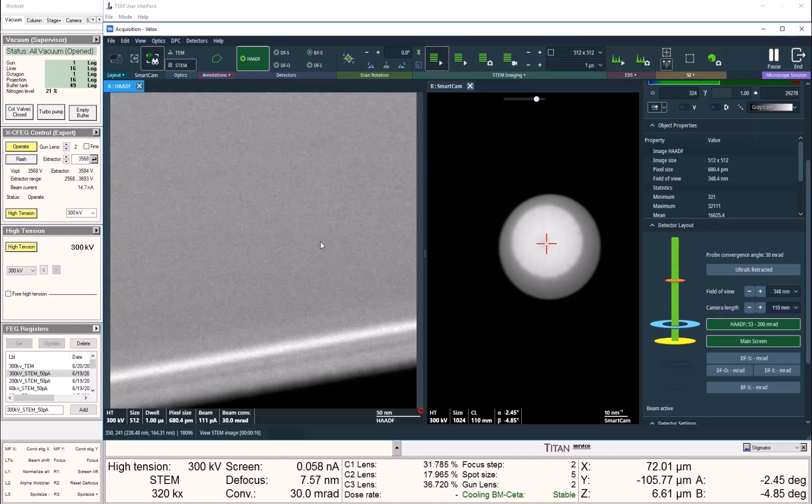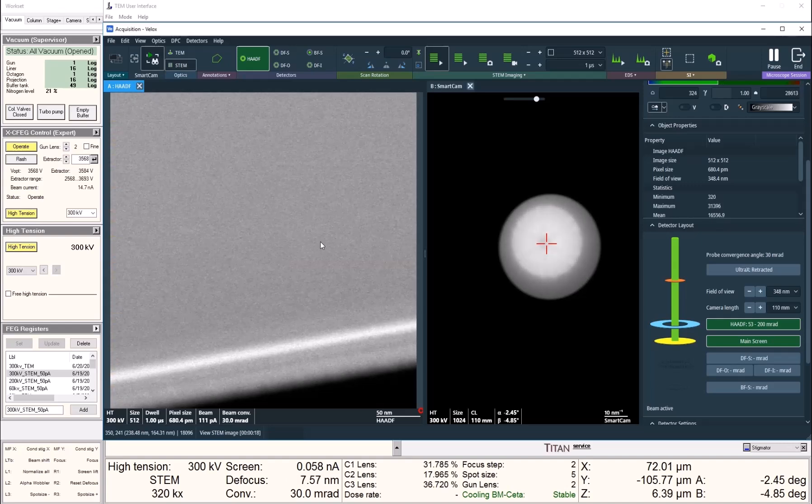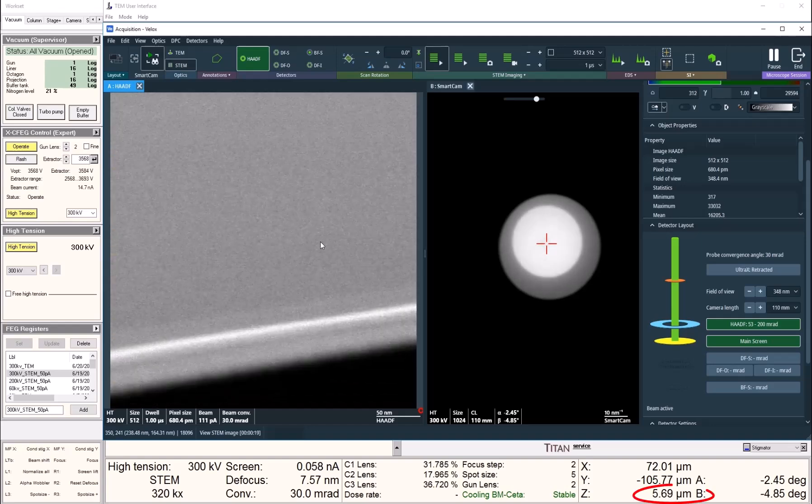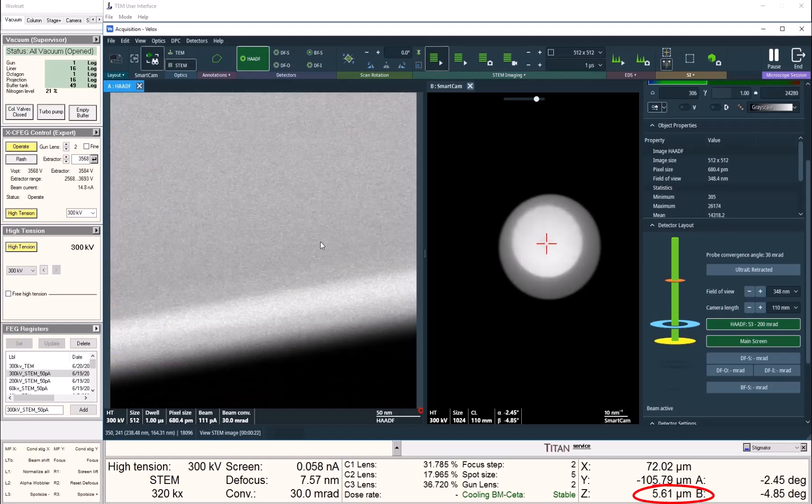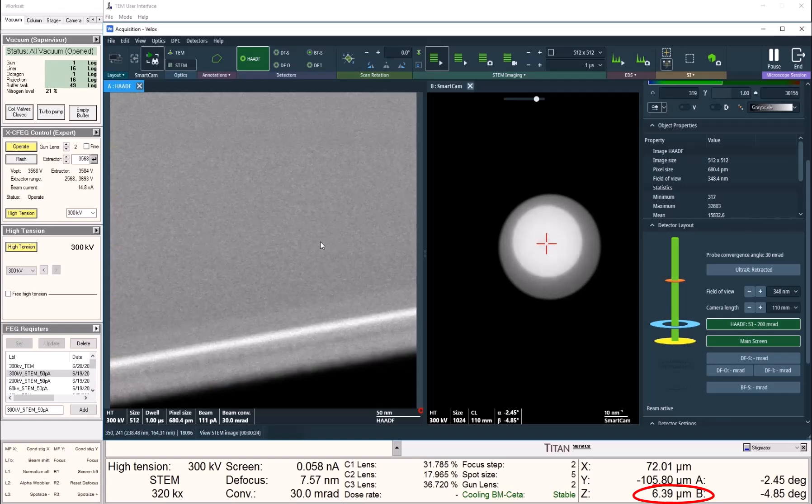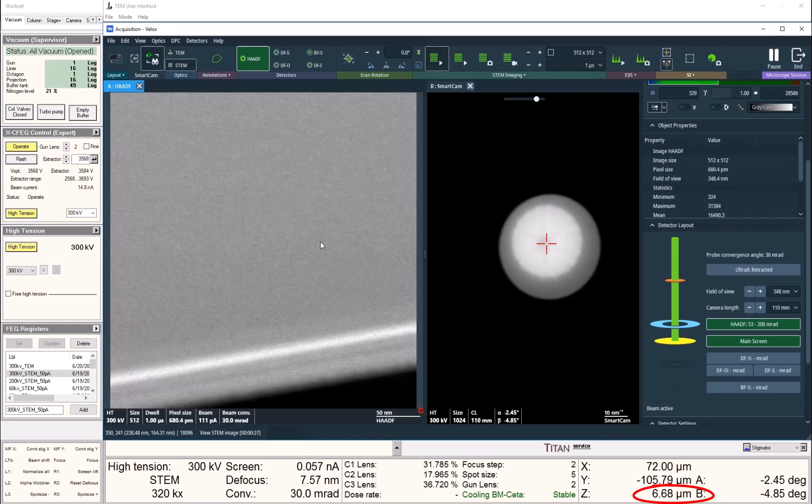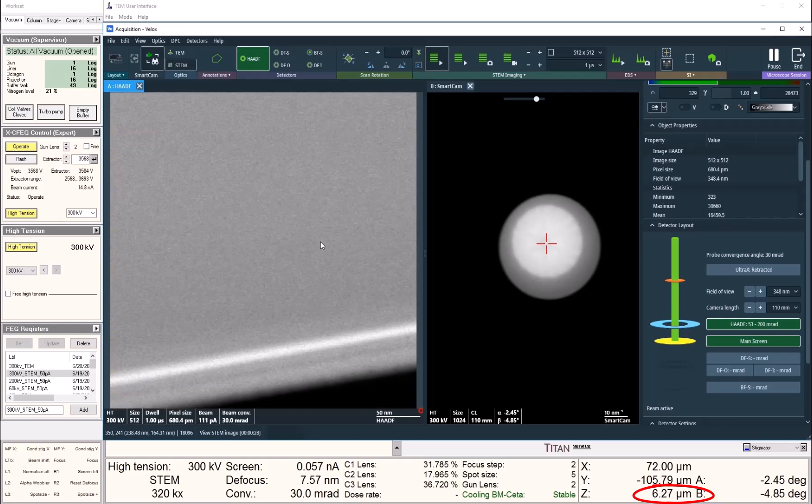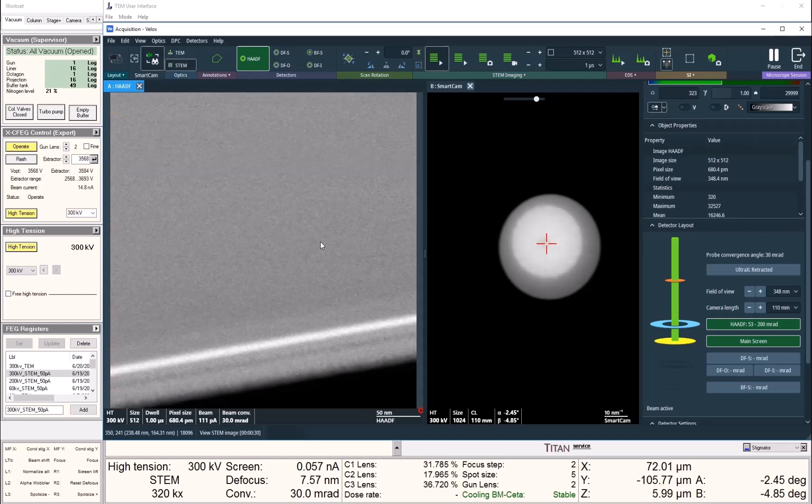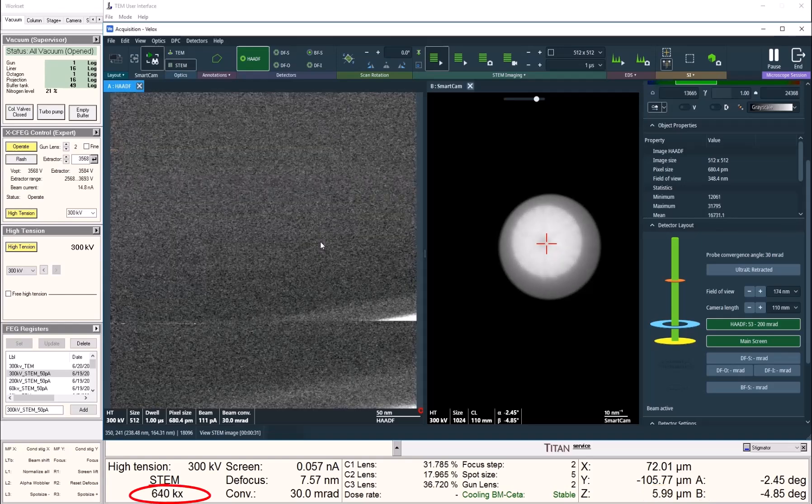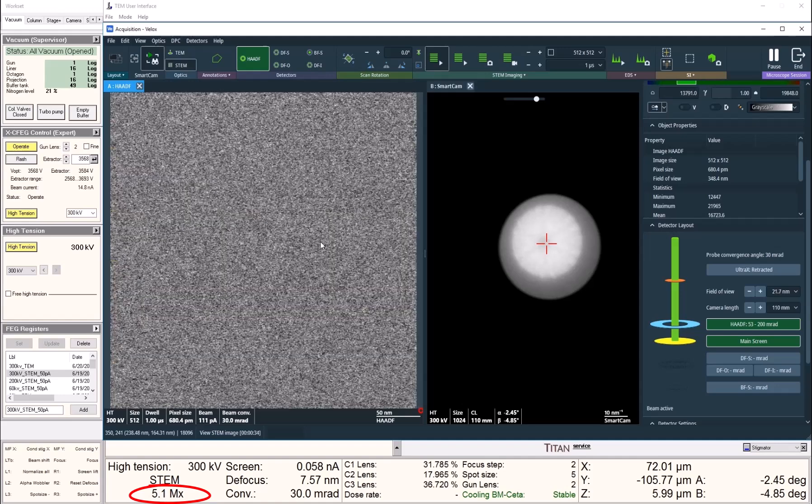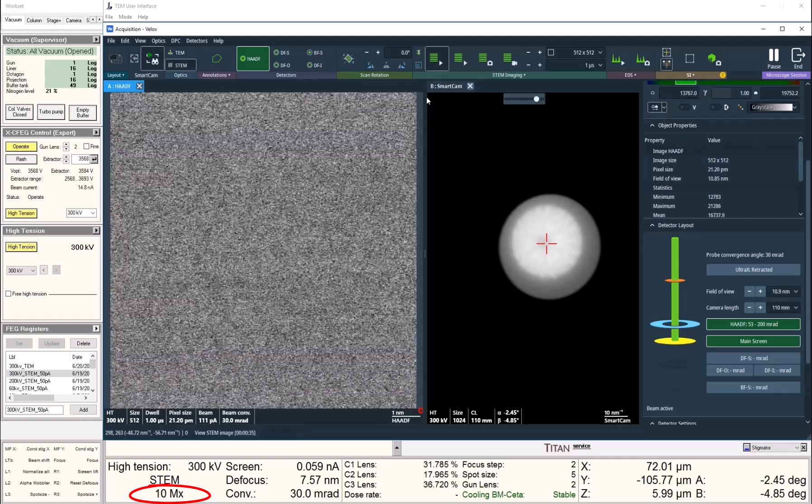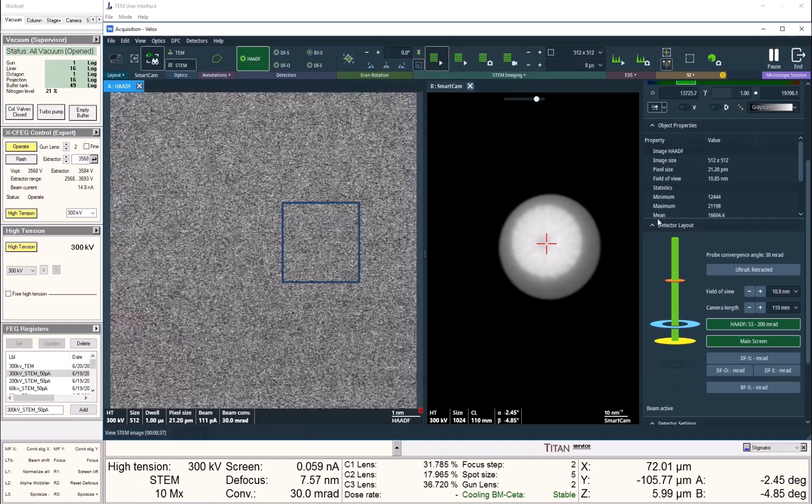Now with my zone axis aligned, I can quickly focus my sample with Z. Then I can zoom in to my region of interest to a magnification of around 10 million times, and we can start to see atomic columns.